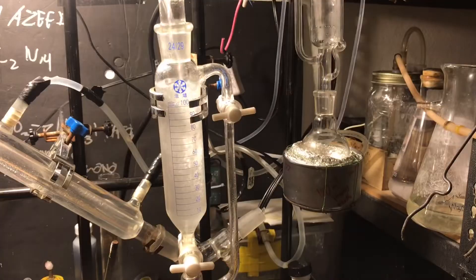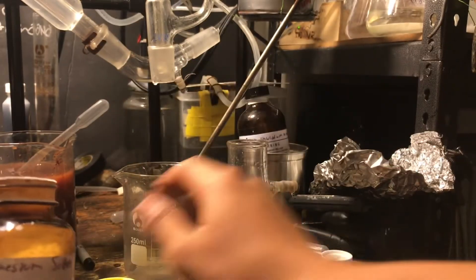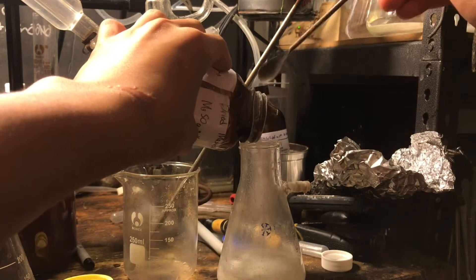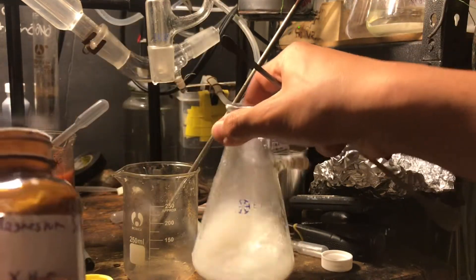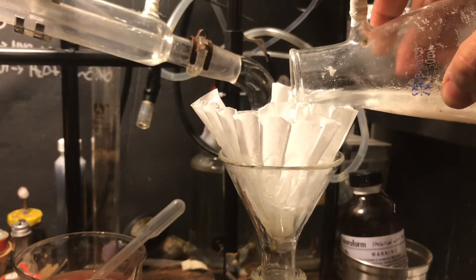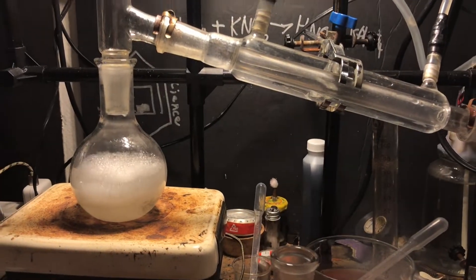I got lazy and just poured chloroform directly into the cinnamon water and used the separatory funnel from there. Take your solvent with the cinnamaldehyde and add in a drying agent. I use magnesium sulfate because it's better than calcium chloride — you cannot change my mind on that. Magnesium sulfate just works so much better.